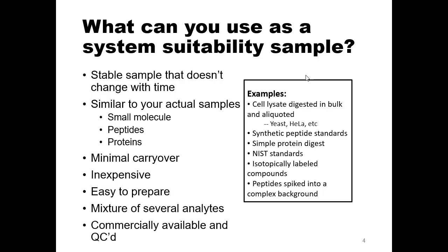Yeah, probably not every single peptide in a complex mix. I would say 25 max maybe, but a representative set of 25 that are always detected and are always stable, extremely well characterized peptides. I have seen labs use keratin, which is one approach, just monitoring for keratin in a sample.